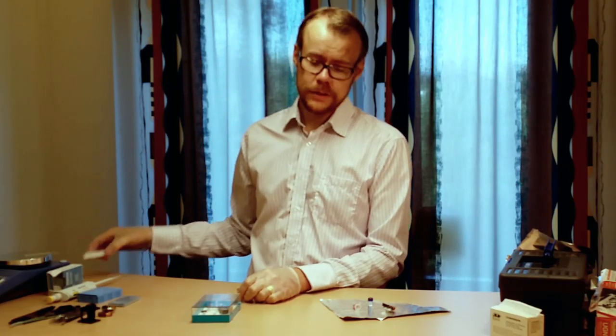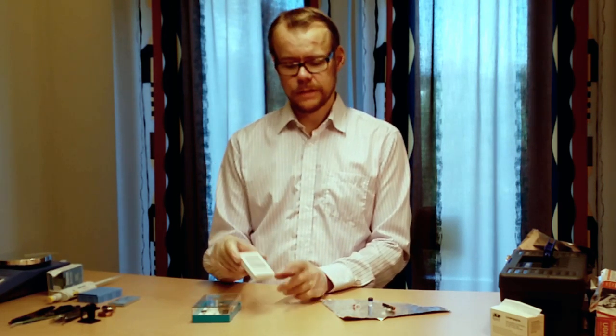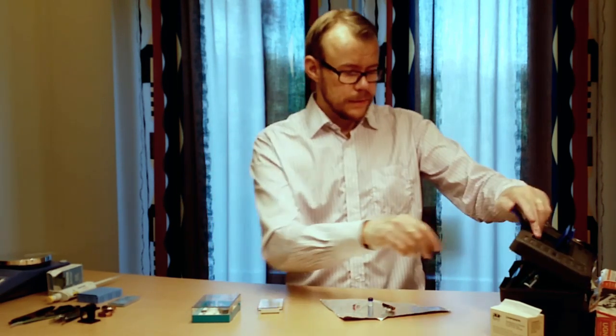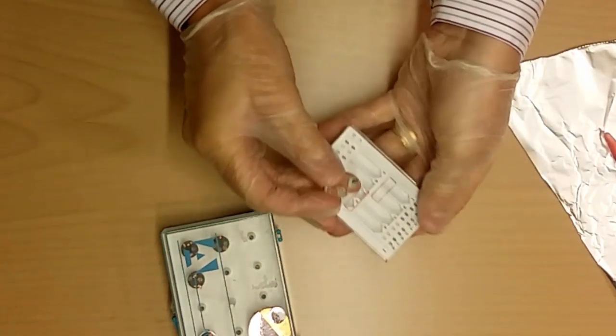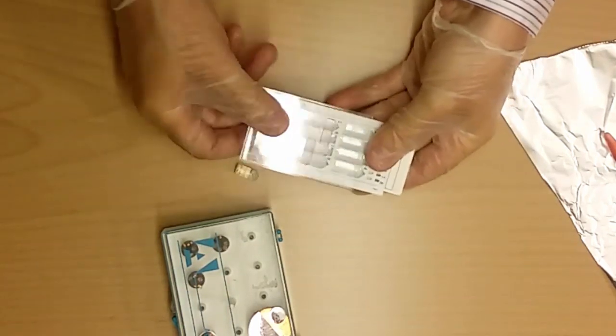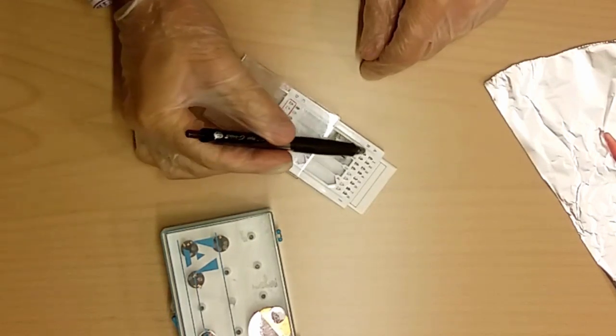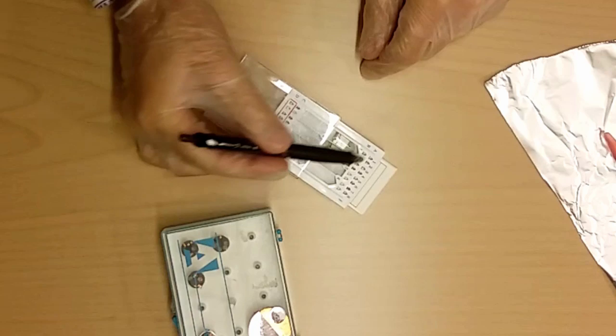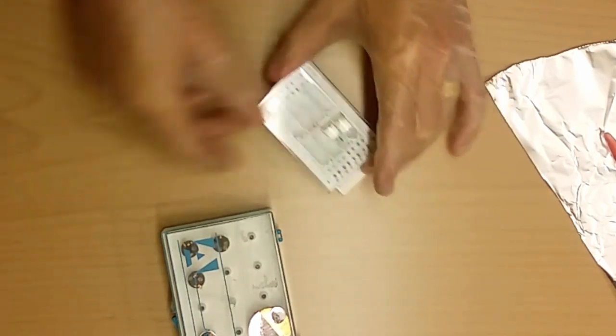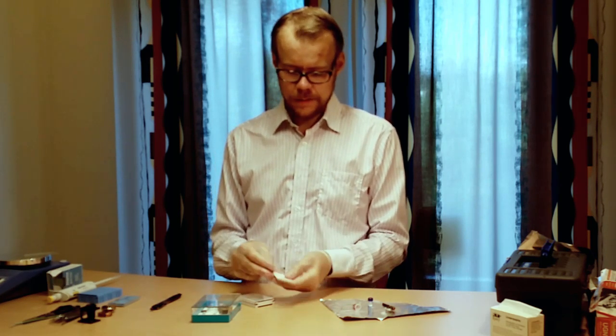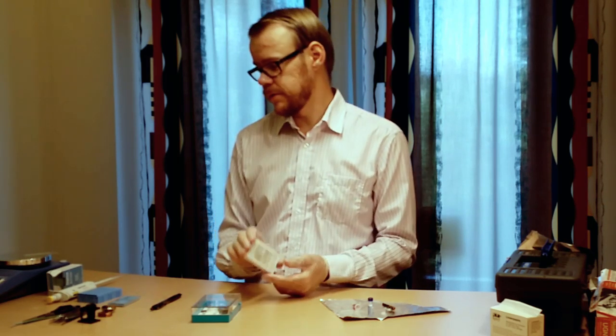If you do transmission electron microscopy, especially if you do on these microtome slices, there are special custom boxes for that as well. Here is one of those. The neat thing with this is that if you have these embedded plastic cylinders that you have cut, they will fit inside here. Like so. And then you can put your grids with your slices on top of here. So then you know that from this cylinder these four grids were cut. And from this cylinder these four grids were cut. It can be lots of slices so it's nice to have some order in it. On the back side of the box you also have some note taking things. To write down what you actually have done. So this is a very neat box if you do microtome in.